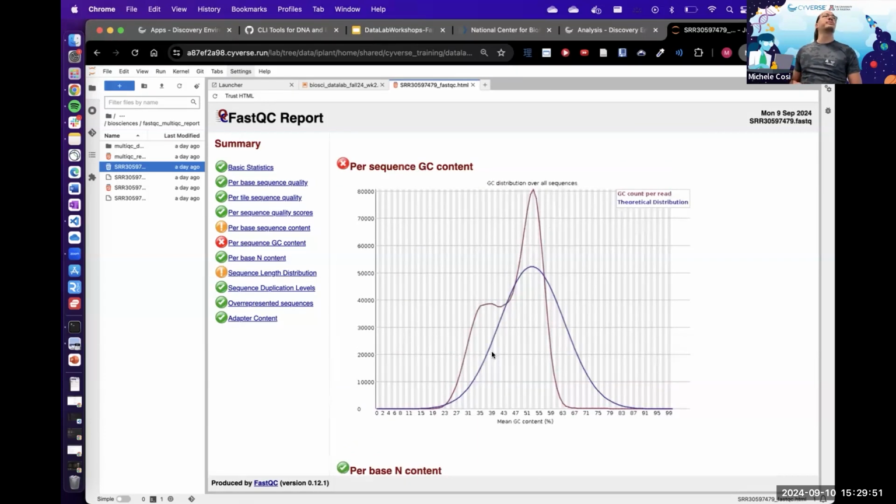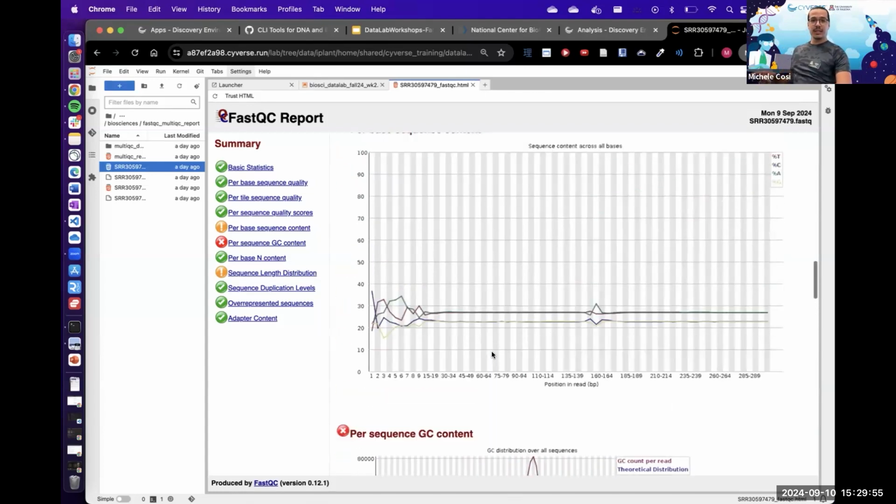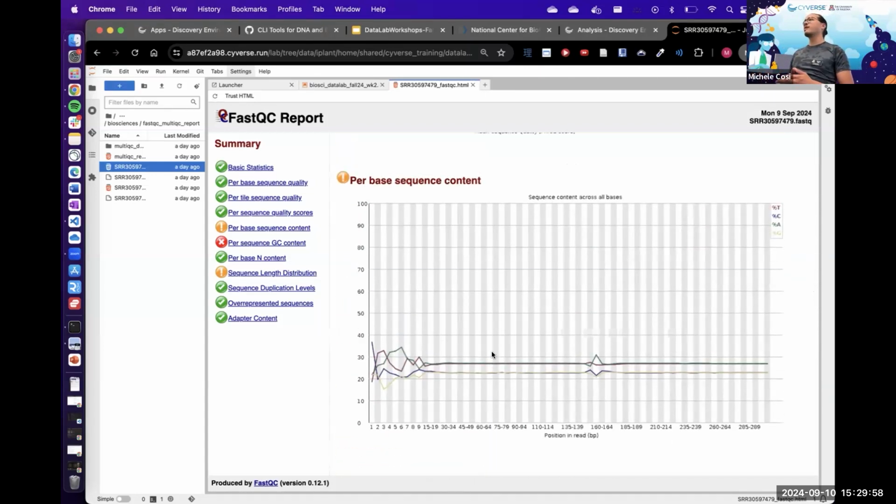Sorry. Okay. Sorry, just a question about the last one, the per base sequence content. Yes. So is that saying that? Sorry, can you explain that again? Sure. I'm going to try my best.